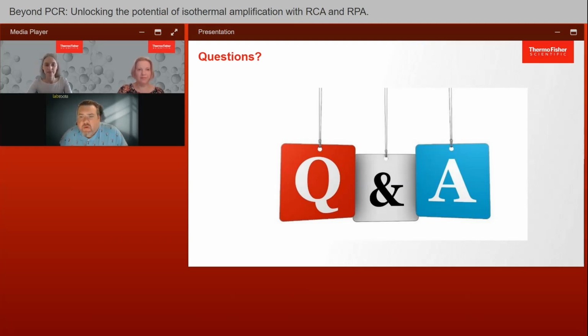All right. One more here for you. Could you make a comparison of the amplification specificity of those above isothermal amplification methods, RPA, RCA, MPRCA, MDA?